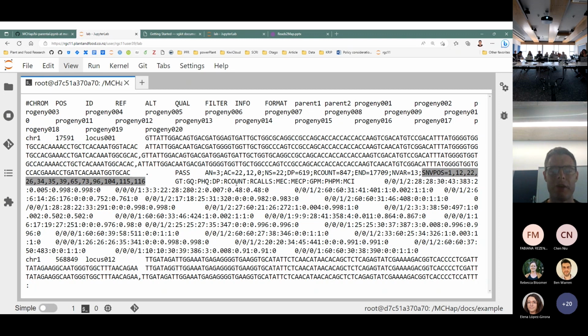And then for this next column, so we talk about columns in VCF that are separated by tabs. The column that I've highlighted there is the information for this particular record. So that's capturing metadata about the variant locus as a whole. And that's followed by the sample data. The final column before the sample data is a description of the fields that are in the sample data columns.